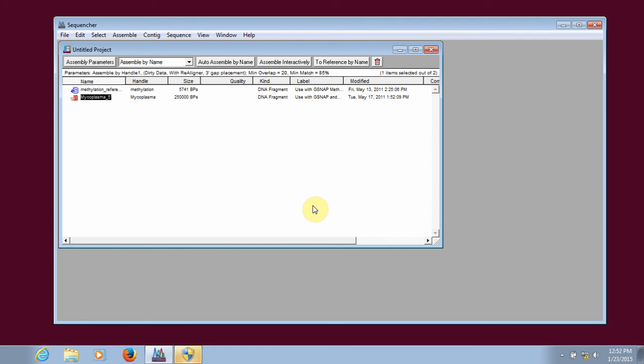In our last installment, we looked at how to align Sanger data with Sequencher. If you have NGS data, the process is a bit different.